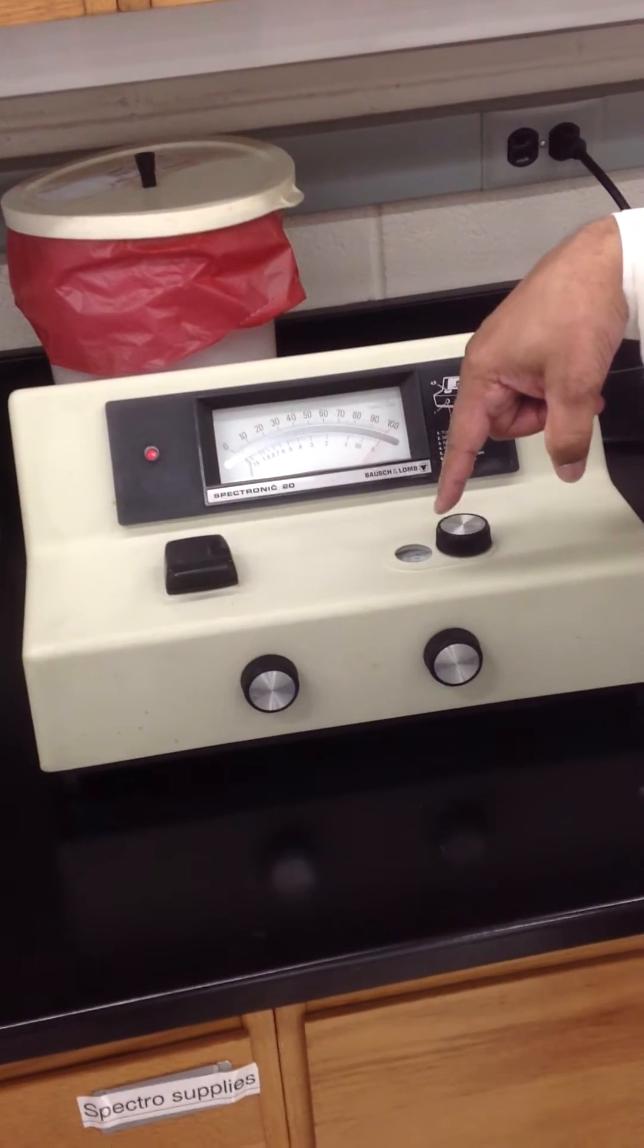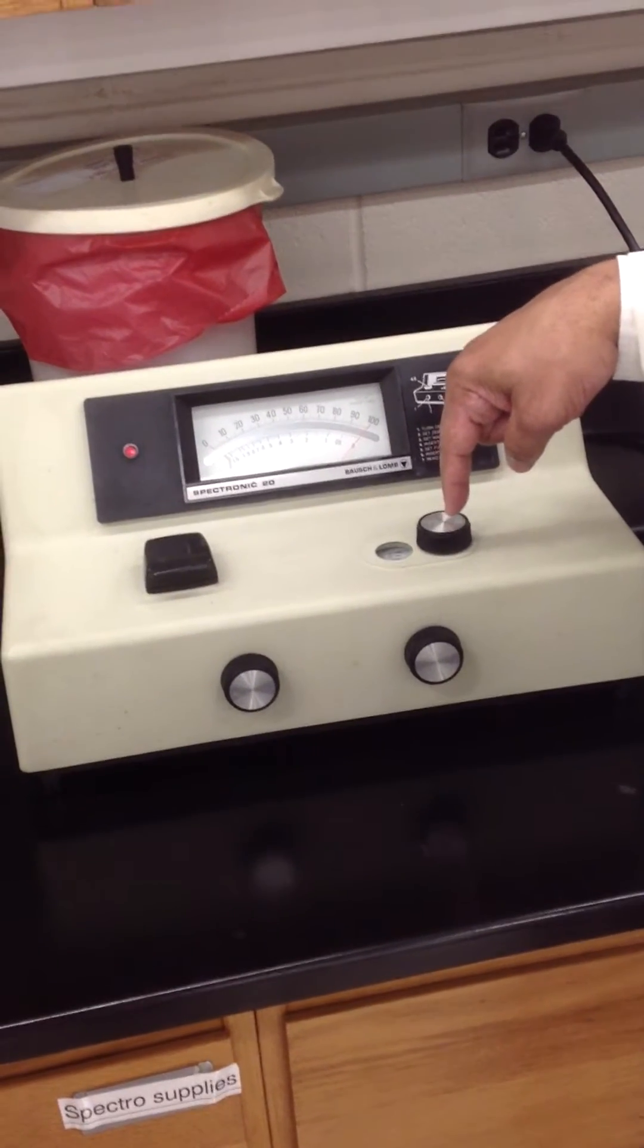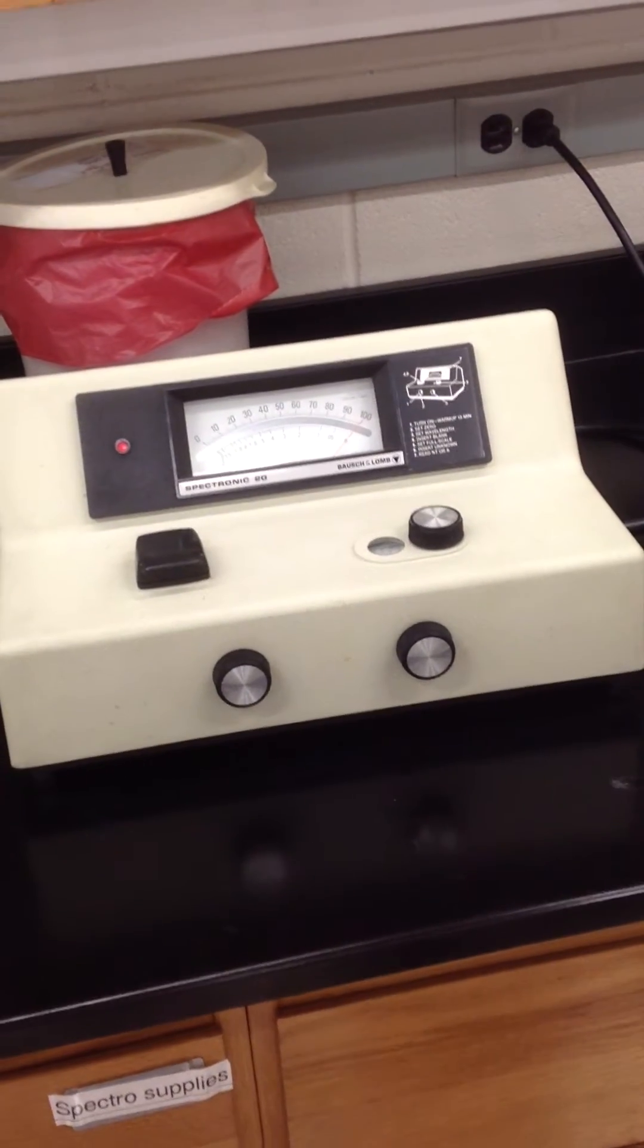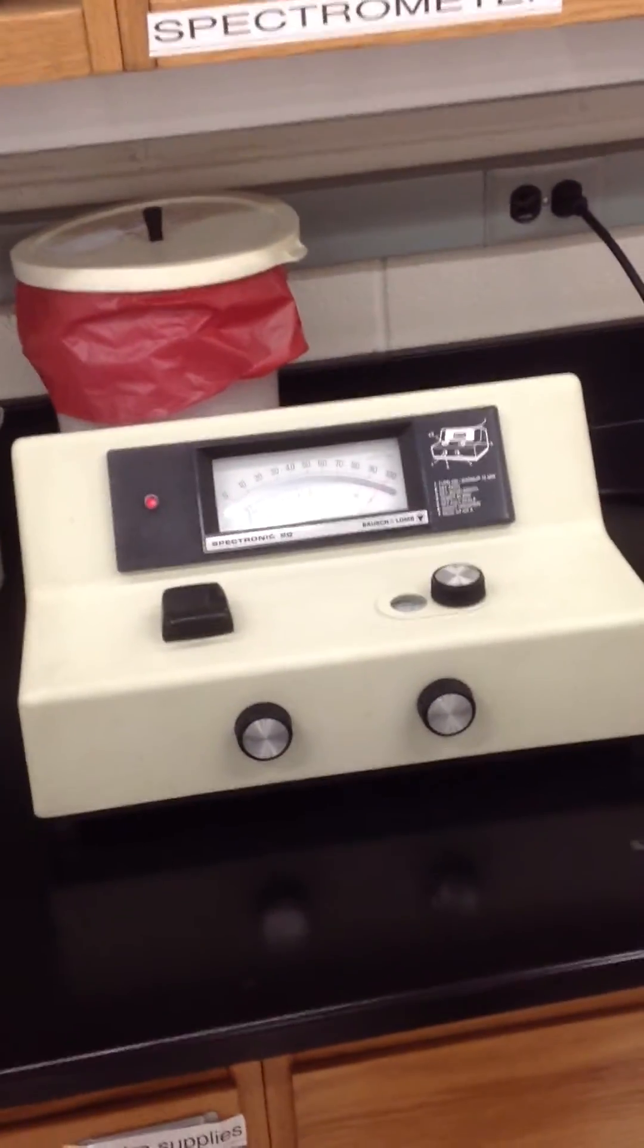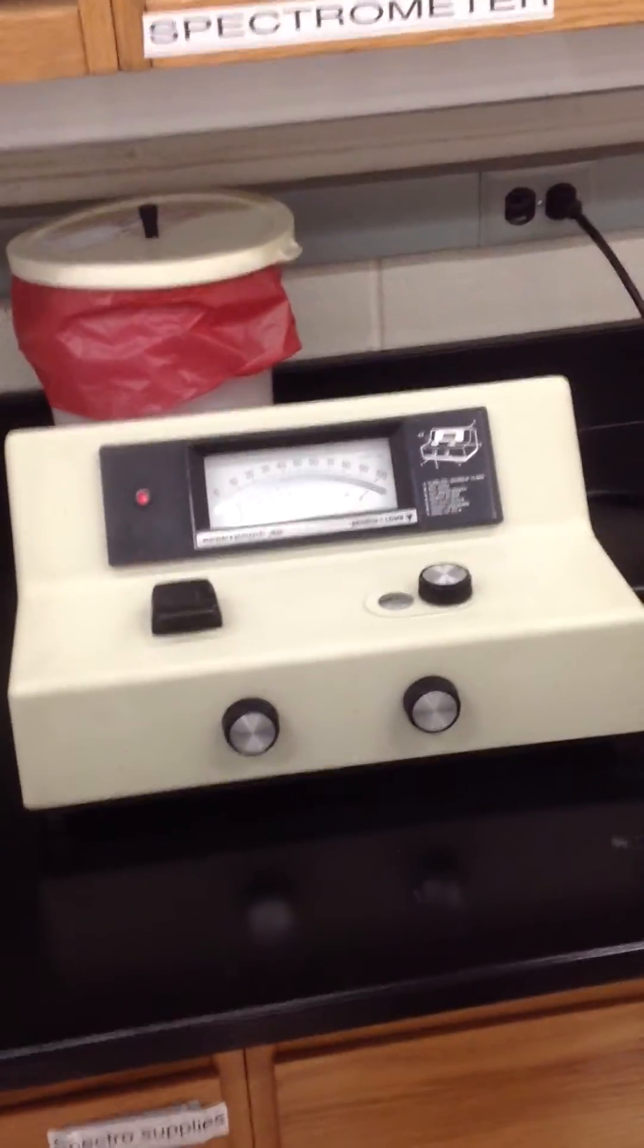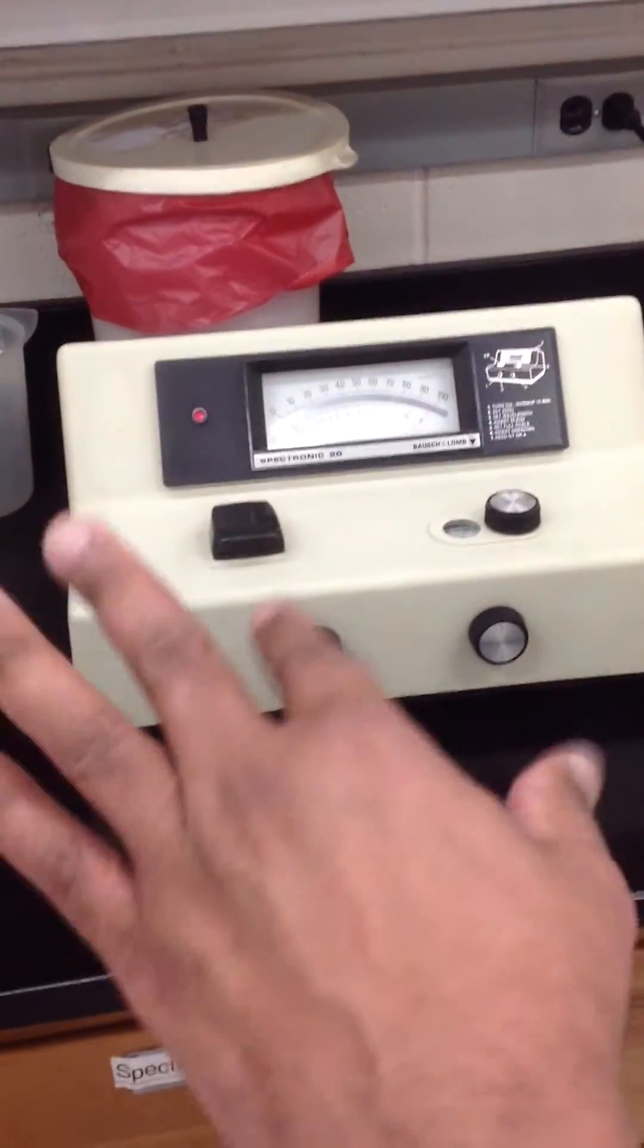Of course, the wavelength is 540 we're using for hemoglobin. So this has to be set, that's always 540 for hemoglobin. So it's not always set on 540, but you're going to make sure it's set on 540. But that's our constant 540 when we're doing for hemoglobin only. If we're doing glucose, that's different.